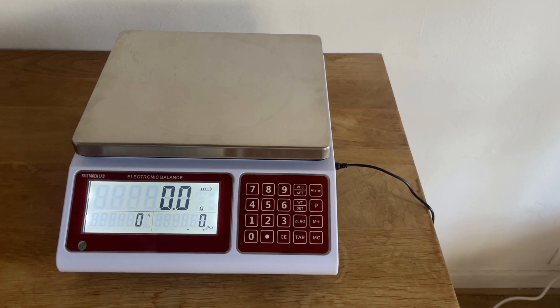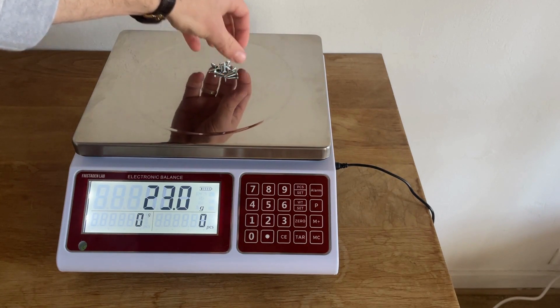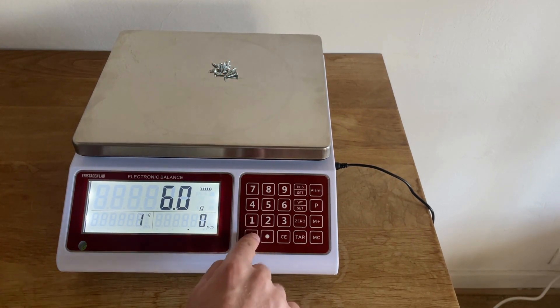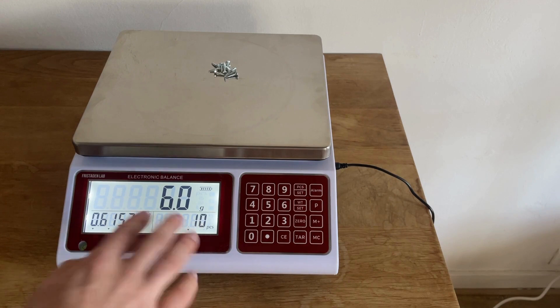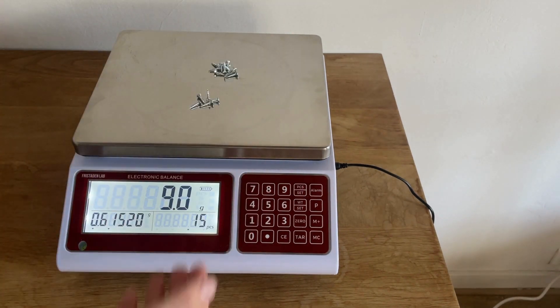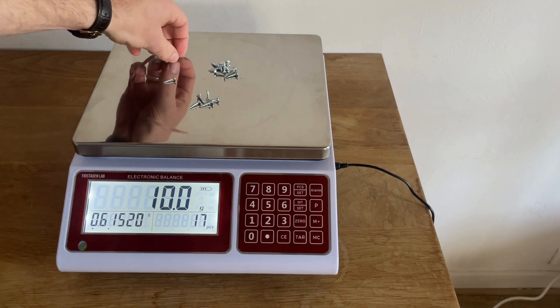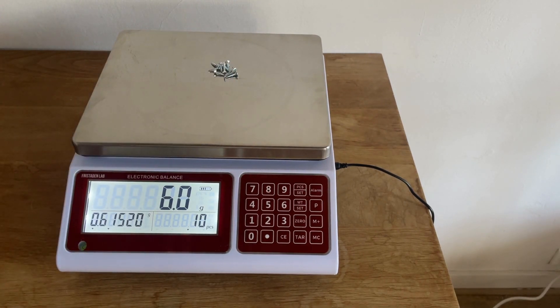To use the counting function, you place at least ten units of whatever you're measuring and press the ten button. It may show grams but it counts the units — for example, you can add five more for 15, then two more for 17, and it accurately counts them. You can use this all the way up to the full capacity of 30 kilograms.